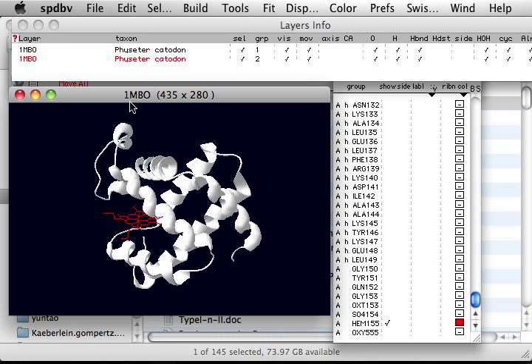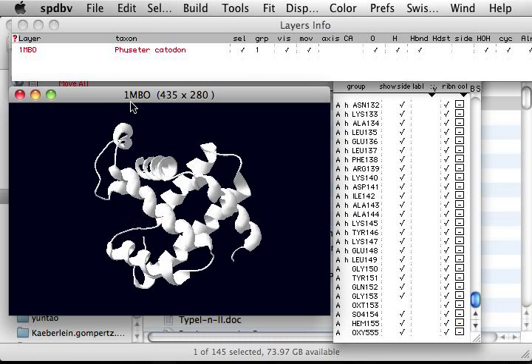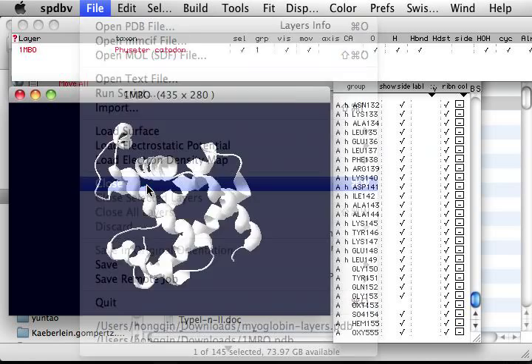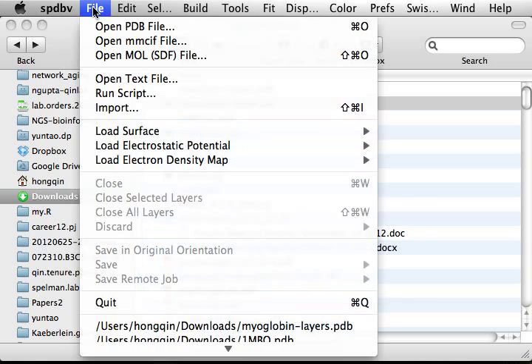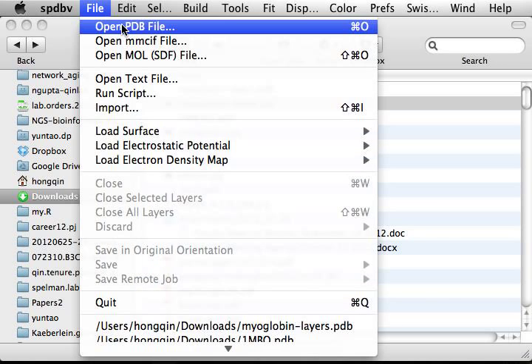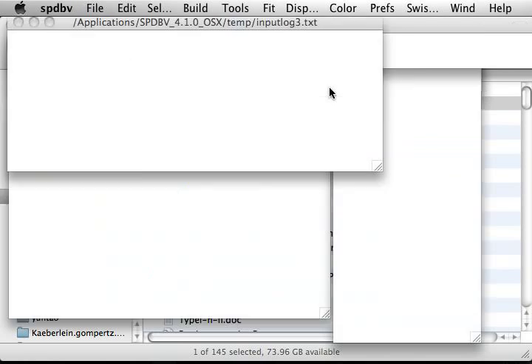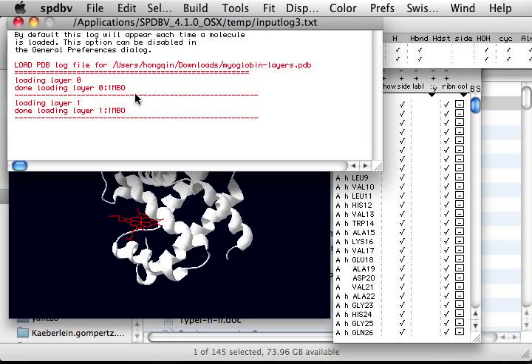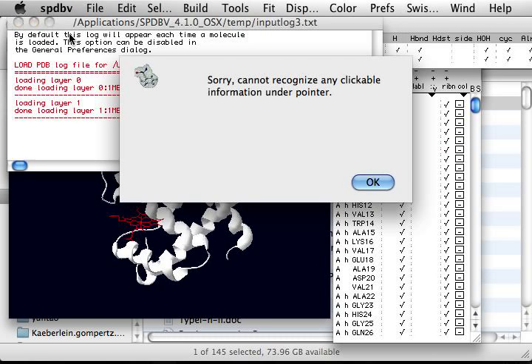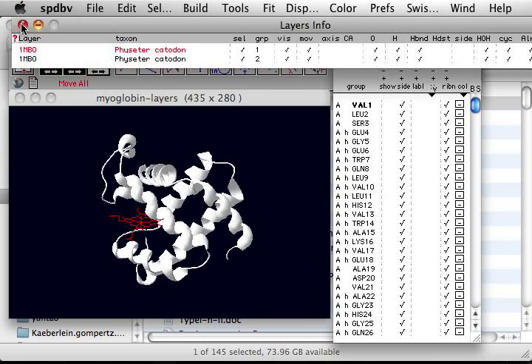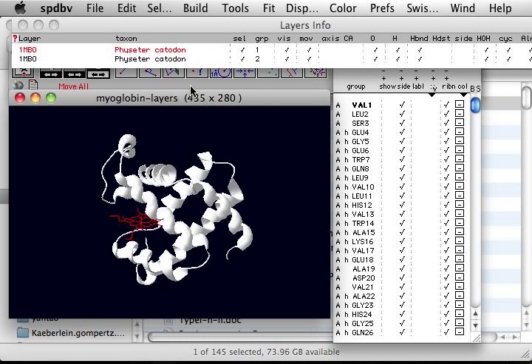If I quit everything and close, there's nothing here. Then I'm going to open that myoglobin layers again. It's coming back. Everything is still there. You can see there are still two layers there.